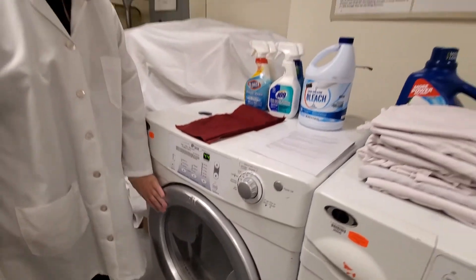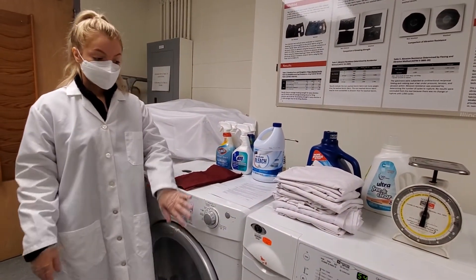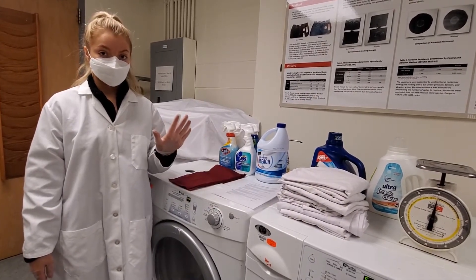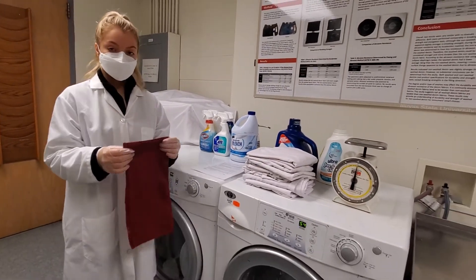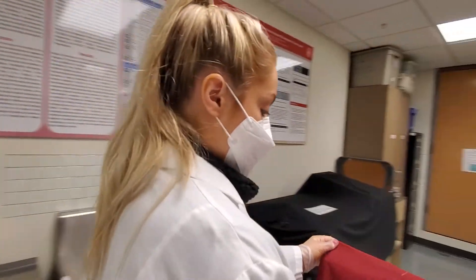Then you're going to let it run four separate times, for a total of five cycles including washing and drying. Then once your specimens have been laundered, you're going to go over to the Macbeth Spectrolite.